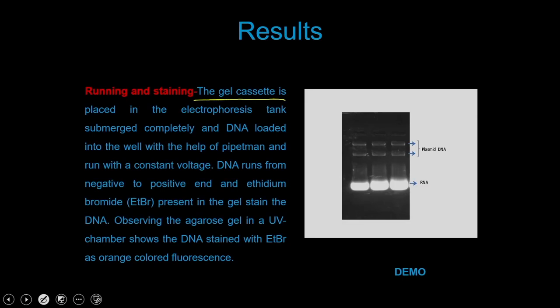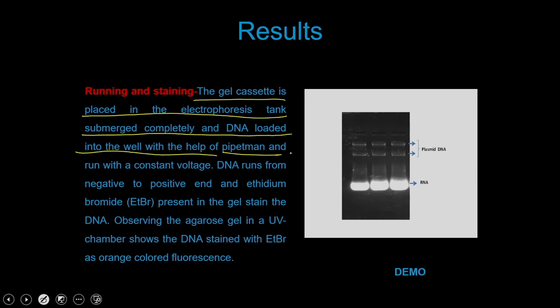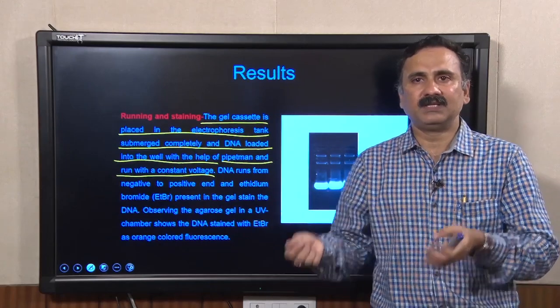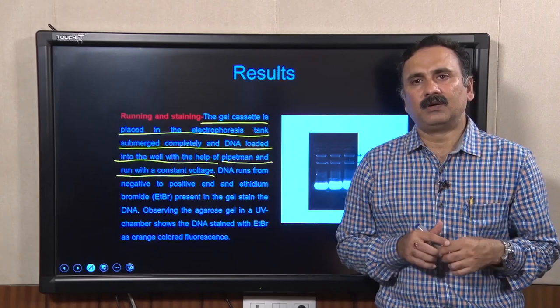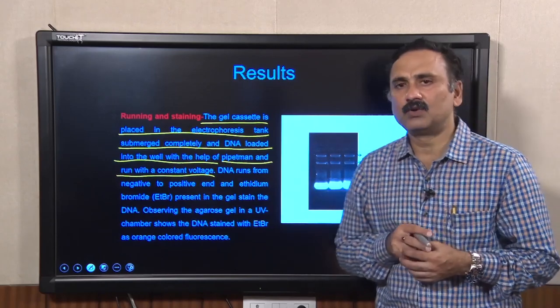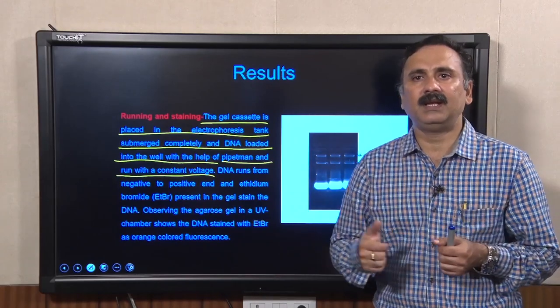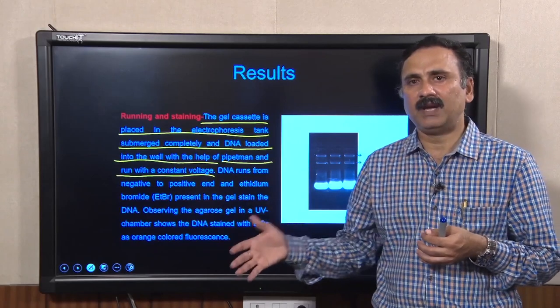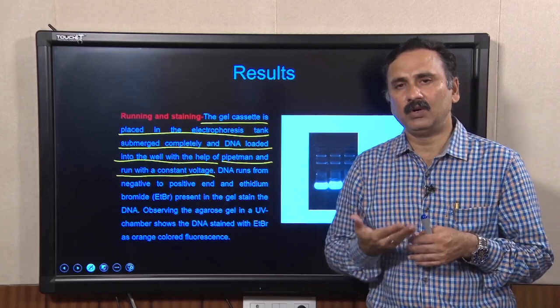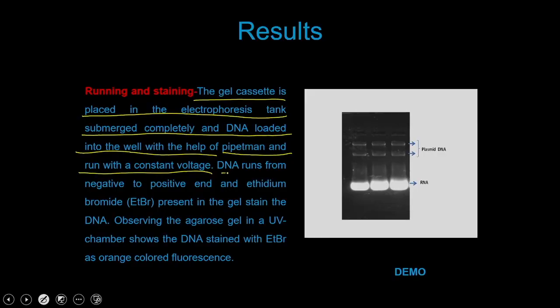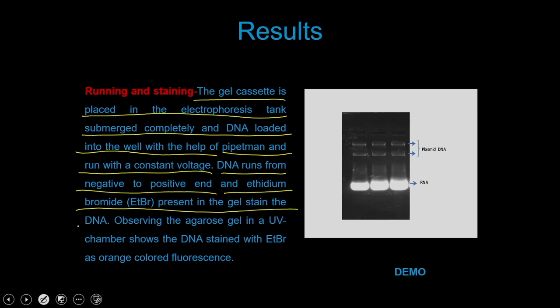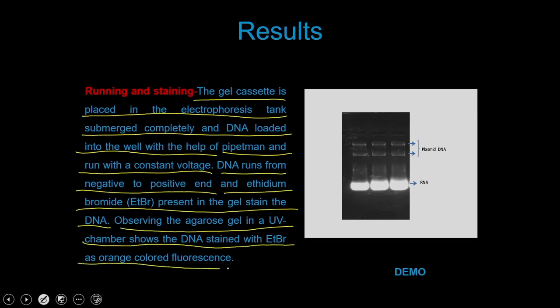Place the gel cassette in the electrophoresis tank, submerged completely, and load DNA into the wells using a pipette. Run at constant voltage. DNA runs from negative to positive end, while EtBr — being positively charged — runs in the opposite direction. As they run in opposite directions, EtBr intercalates within the DNA. Observing the agarose gel in a UV chamber shows DNA stained with EtBr as orange-colored fluorescence.